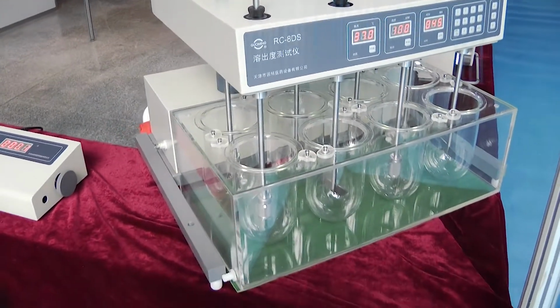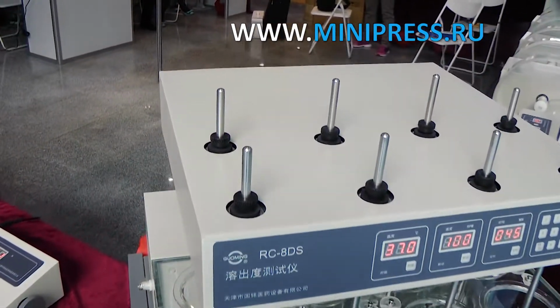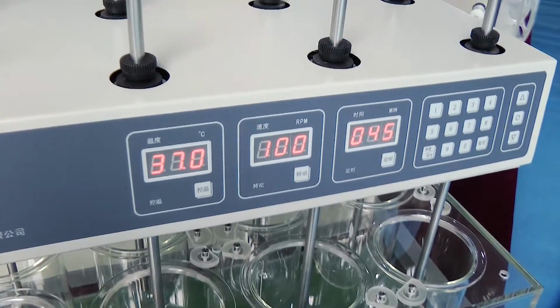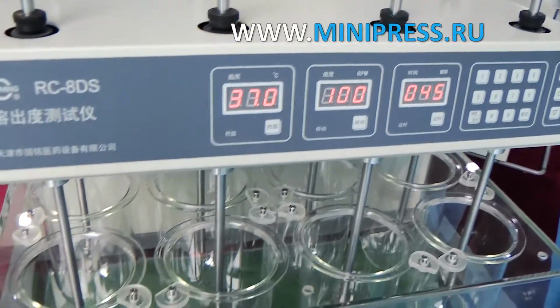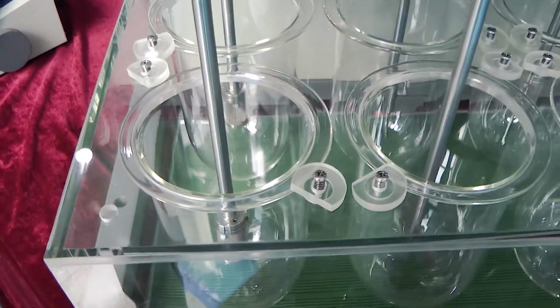analytical and laboratory equipment. Using analytical equipment, they monitor the ratings of moisture level, melting time, transparency, dissolution, hardness parameters, thickness, viscosity. Many analytical operations to determine the quality of raw materials and finished products we conducted on outdated laboratory equipment, which often did not provide indicators of verification.